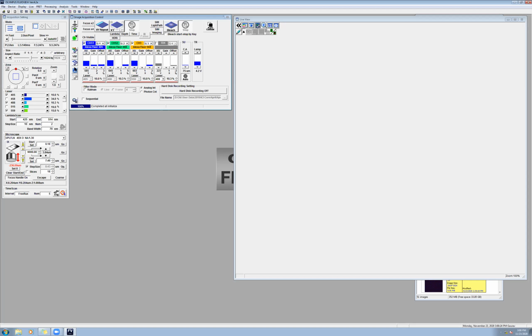Okay, so that is something which is controlled from here. All right, so let's start, and this is what I would do every time you are here. I will start with individual channels. So let's start with just the blue channel to begin with.